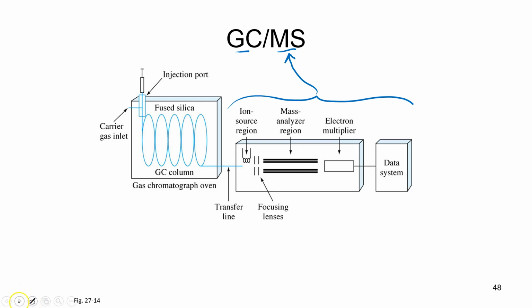again of the power of GCMS. So let's imagine that we injected a standard that contained some known concentration of bisphenol A, that's what BPA is, along with an internal standard. Here is the injection port in our GC, and our solutes flowed through the column and got separated. And let's imagine that the bisphenol A eluted first. It now enters the mass spec where it gets ionized.